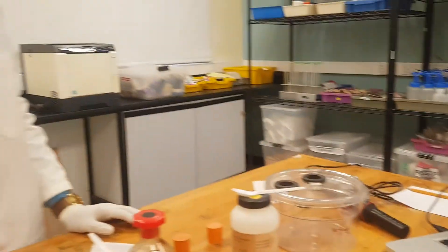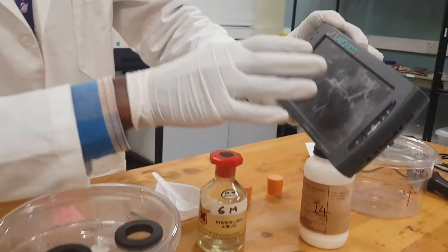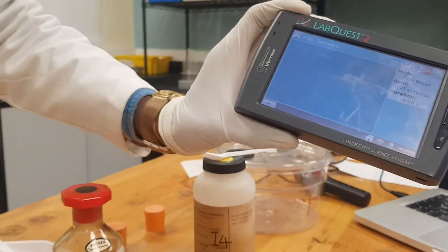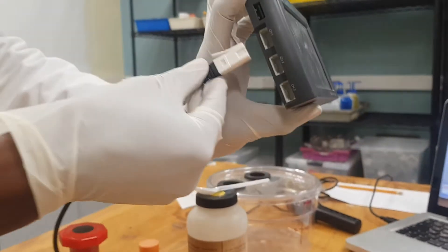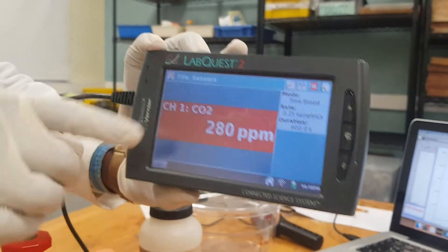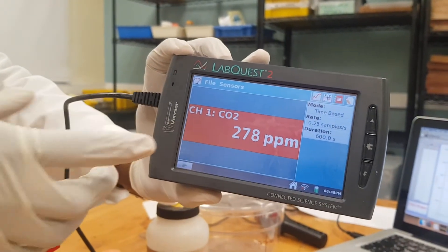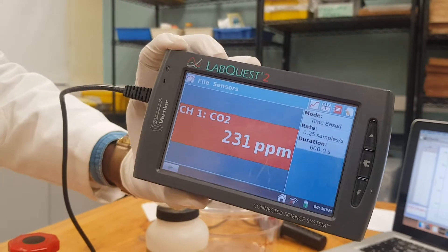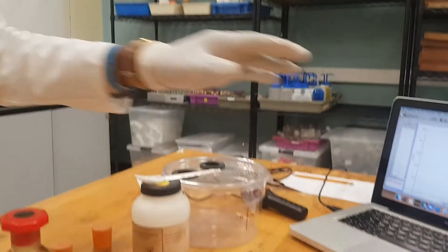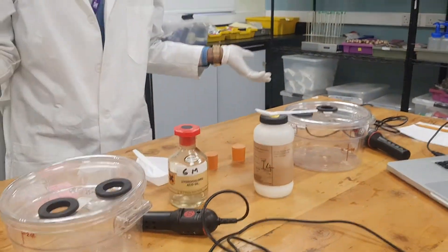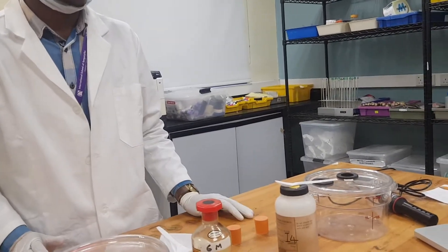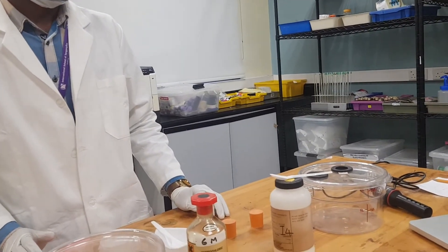The same applies when you use the LabQuest 2. If you check it, there are some ports here, and once you connect and start to read, it reads the concentration of carbon dioxide found in this room. So here it's connected, but we have not yet begun our reaction to have the carbon dioxide detected.